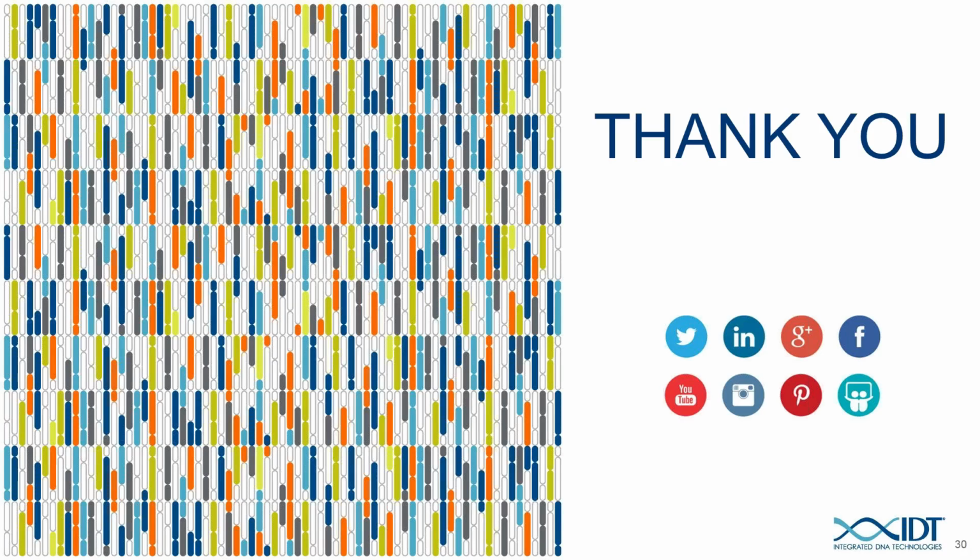multiplexing ribonucleoprotein. It does seem like the footprint of the Cas9 molecule needs a sufficient amount of space to be able to make 2 proximal cuts, and it also depends upon whether or not the 2 guide RNAs are on the same strand or on opposing strands. So if we think about the worst case scenario where it's 2 guide RNAs on the same strand, and so the orientation of both RNPs are on the same strand, I would recommend at least 20, if not moving to maybe 30 or more bases apart from one another.